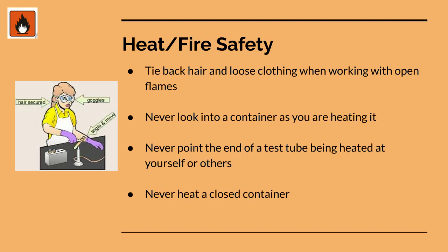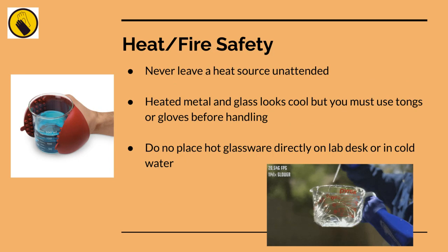That's not cool. Or even if you fried up bacon, do you want to look directly into a pan closely and get bacon grease in your eyes? No, so don't do it here. Never point the end of a test tube being heated at yourself or others. Pretty much just an expansion on the second point. And then finally, never heat a closed container. Again, self-explanatory. We should all know this.